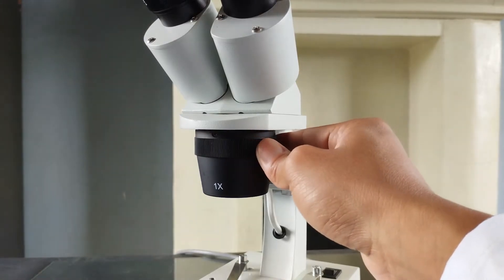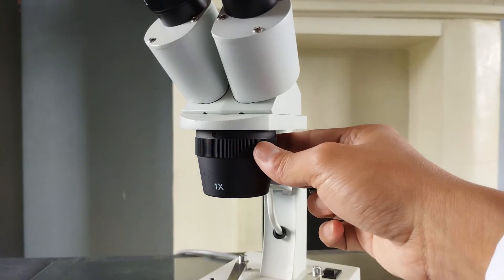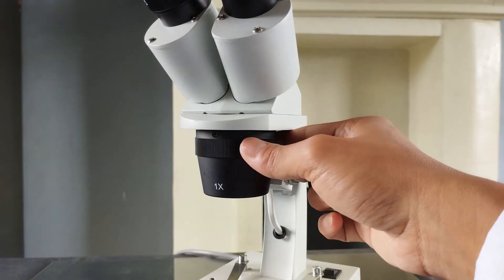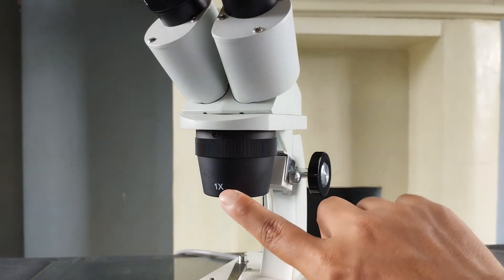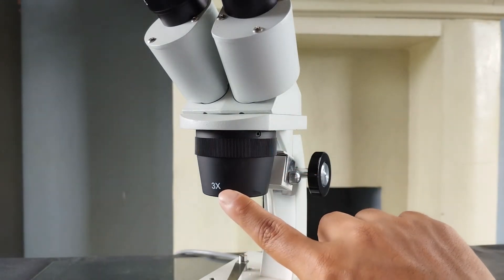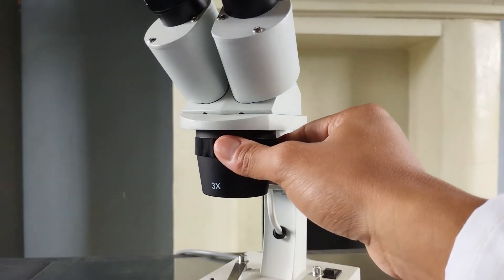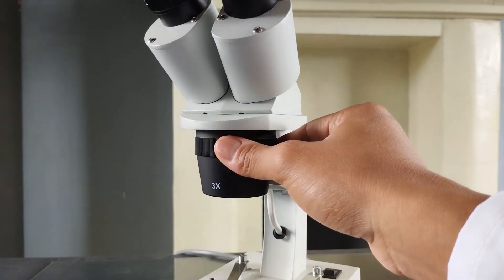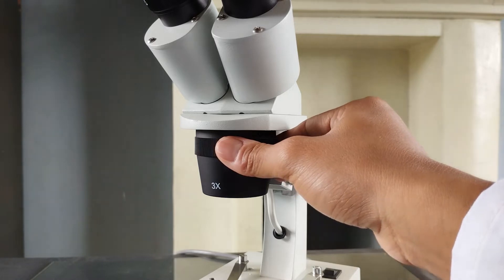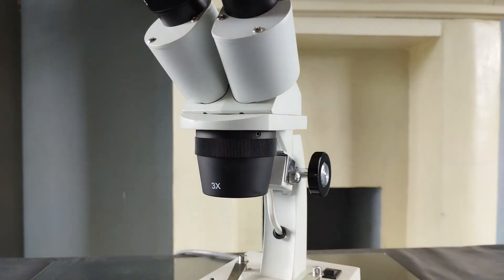In this particular model that I am using for this video, the built-in objective magnifications are 1x and 3x. So, if the eyepiece lens is a 10x and I use a 2x objective, then my specimen would be magnified 20 times and so on. In this way, a typical stereo microscope, depending on the model and the optics combination, one can magnify objects within a range of about 10 times all the way up to about 120 times or even 150 times.